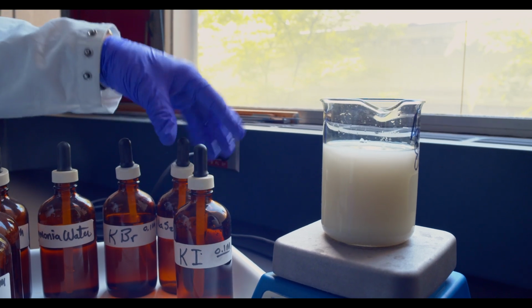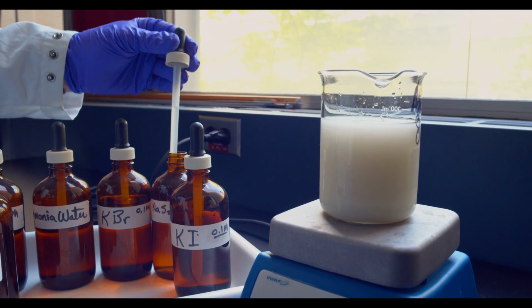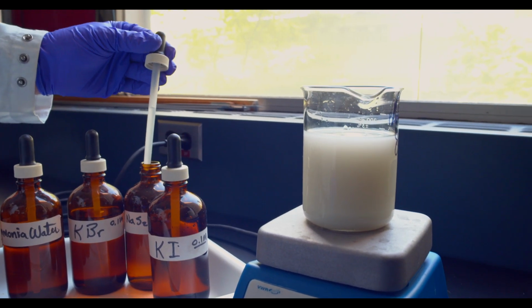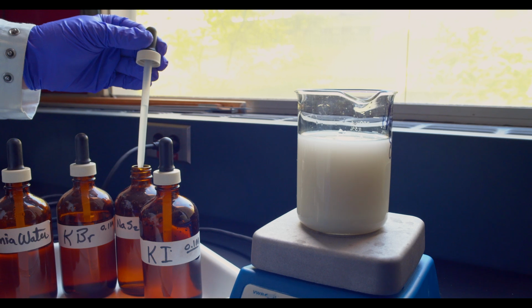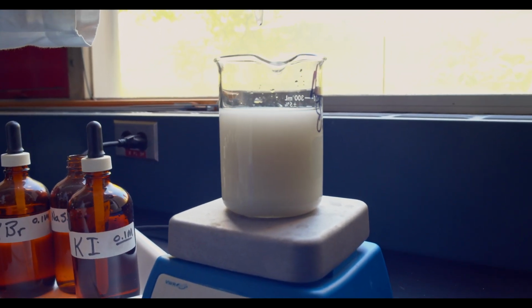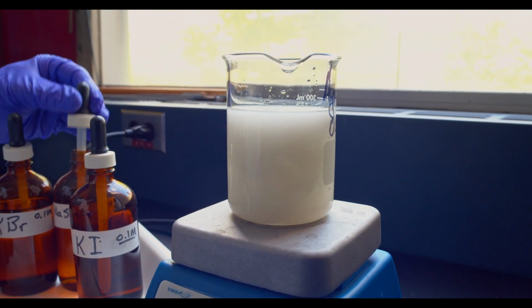Next, we go to the sodium thiosulfate, and if you've ever done black and white photography, silver bromide is what silver paper is made of, and sodium thiosulfate is known as fixer solution because it dissolves the unexposed silver in the paper.